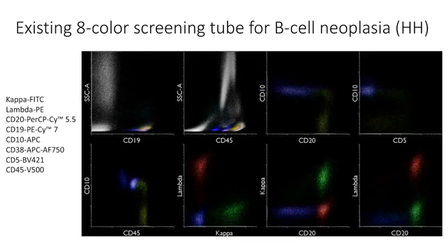It's been very reliable. Here we're gating on CD19 positive B-cell events. This is a normal bone marrow. You can actually see the development going from weak CD45 to brighter CD45. Meanwhile, the earliest cells, which are bright for CD10 and negative for CD20, will lose some CD10 and start to acquire CD20. We have transitional B cells here, and ultimately the mature B cells.